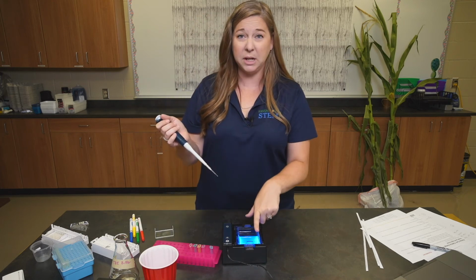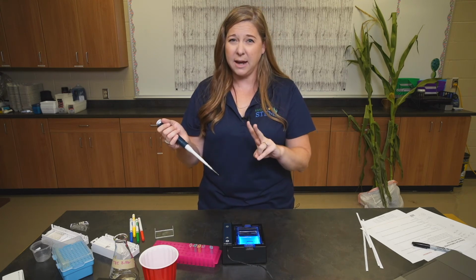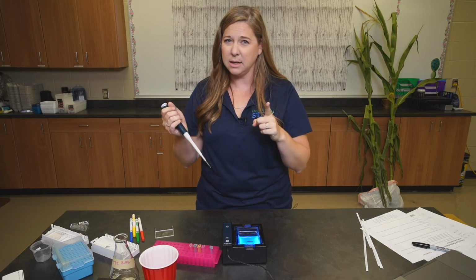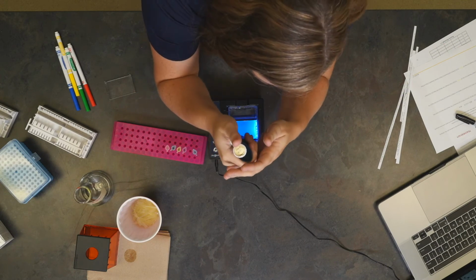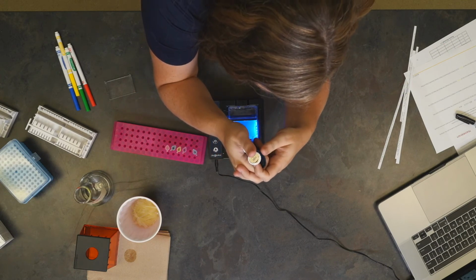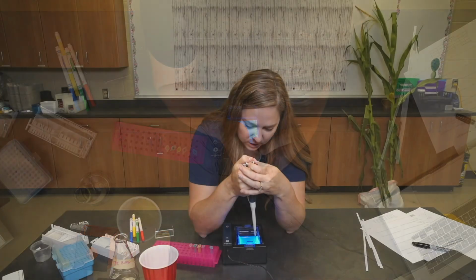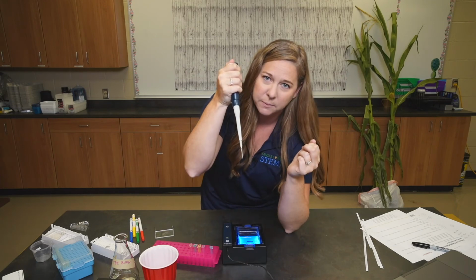From here, we're going to put it in the very first well. This is the tricky part. There are 2 tips I have here. Number 1, use your elbows, and number 2, steady and slow. If you put your elbows down on the table, you can go straight up and down, all the way into the well, depress the plunger all the way down, and holding it down, pull my hand straight up.